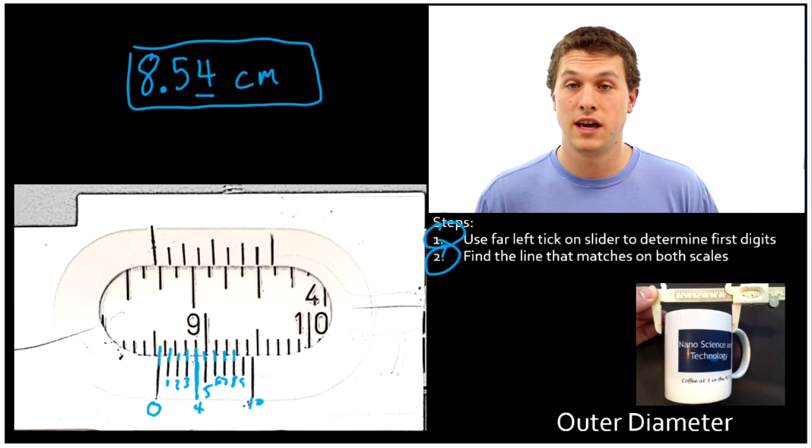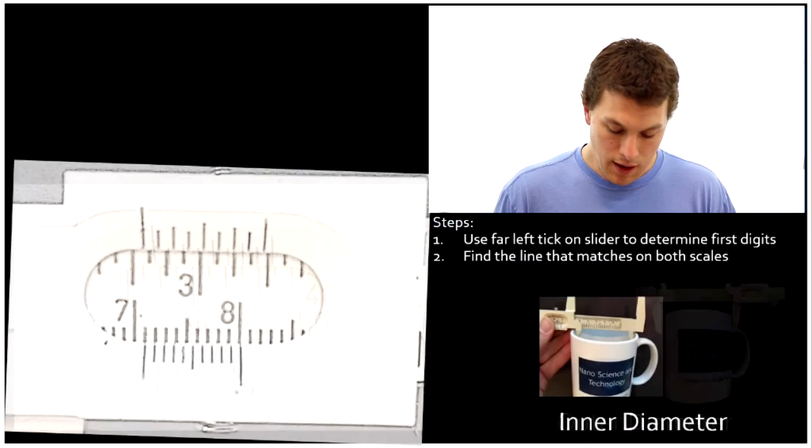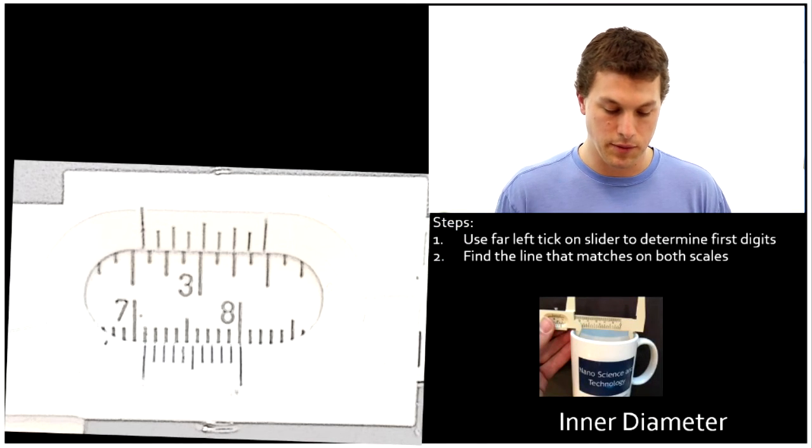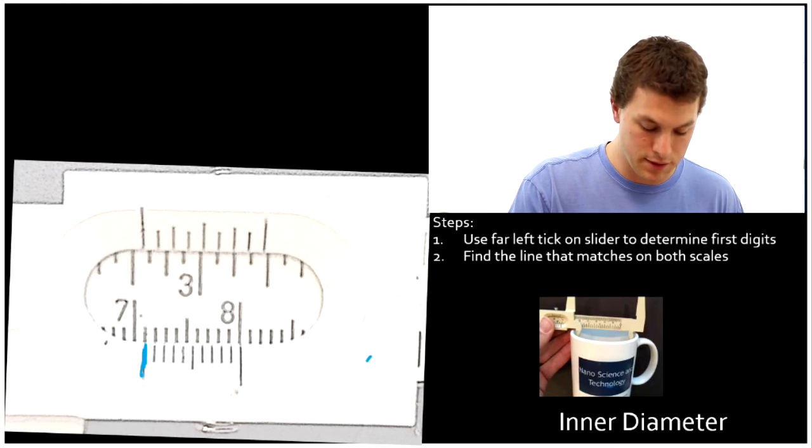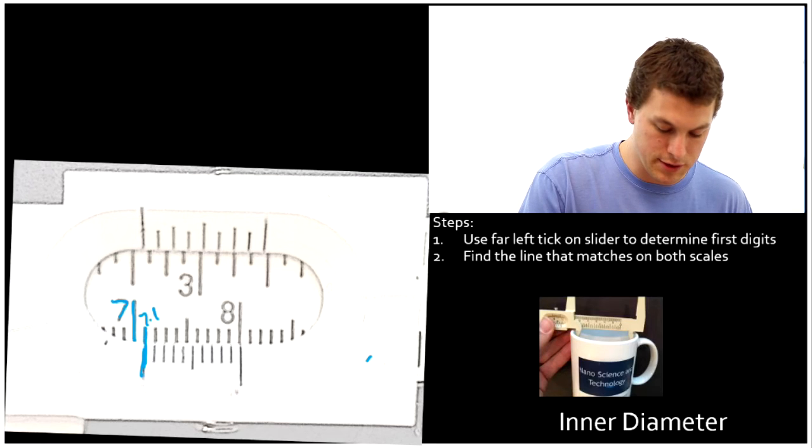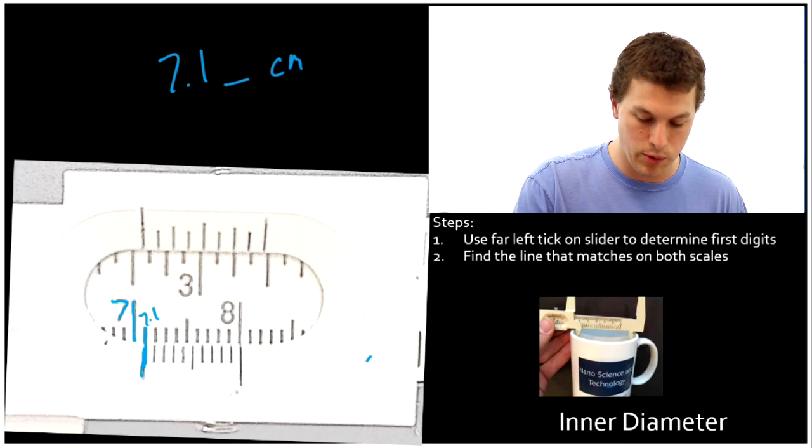Let's do two more examples. These ones should go faster now that you're sort of oriented. This one's the inner diameter of our coffee mug. Once again, we're going to look at the leftmost tick. We see that it lines up with the first tick past 7. Here's 7, and then we see this guy is where it lines up. That's 7.1. So that tells us our first two digits are 7.1 centimeters, and we need to figure out what we want to write at the end of that.